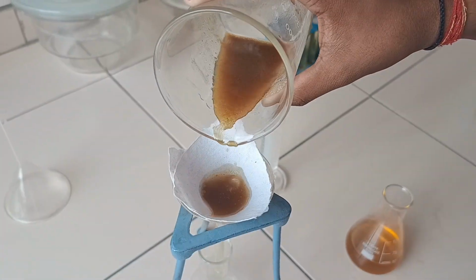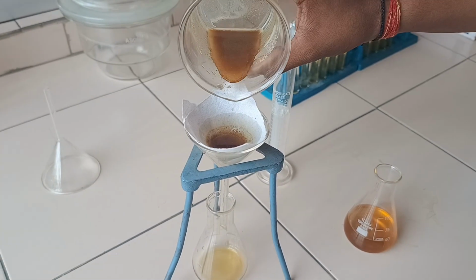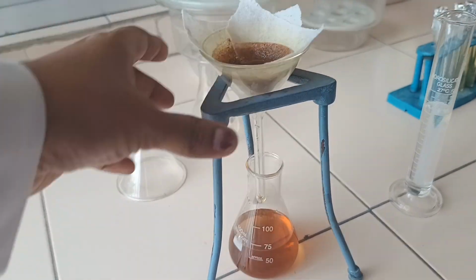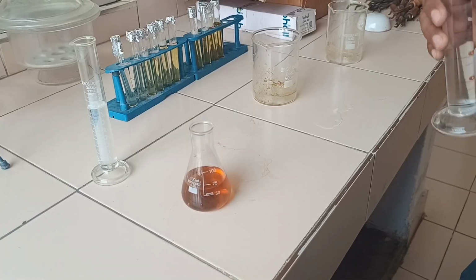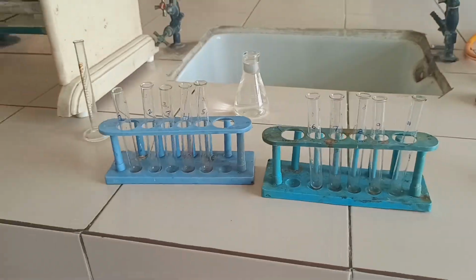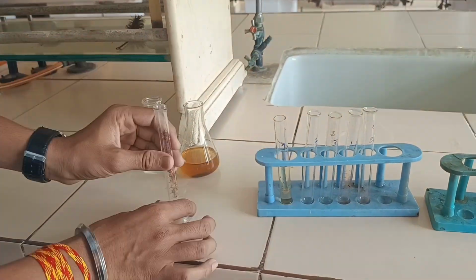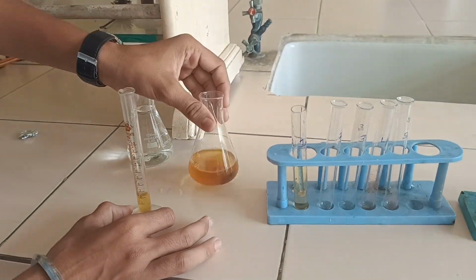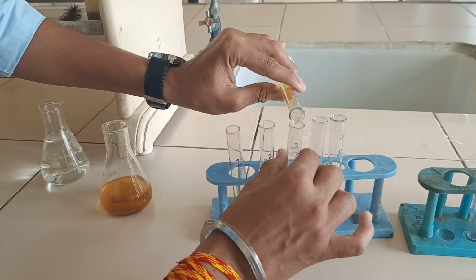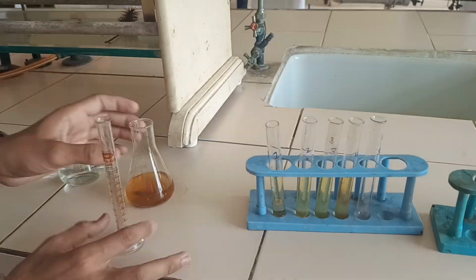Now collect the decoction or the filtrate in a 100 ml conical flask and adjust the volume of the extract to 100 ml using distilled water. Pour the decoction into 10 test tubes as 1 ml, 2 ml, 3 ml up to 10 ml and adjust the volume of the liquid in each test tube to 10 ml by adding sufficient quantity of water. Here we have used a measuring cylinder directly to make up the volume.